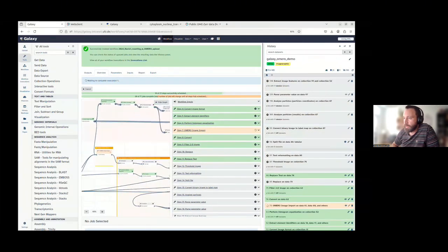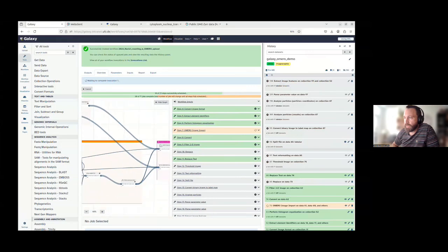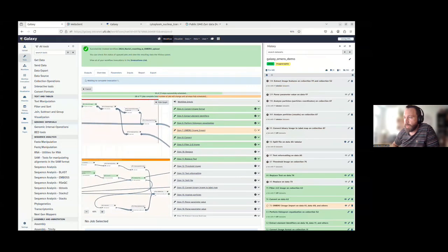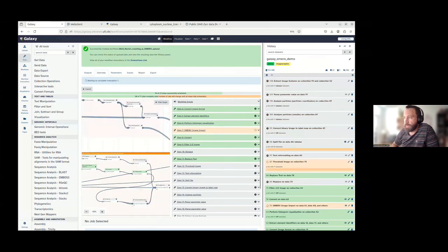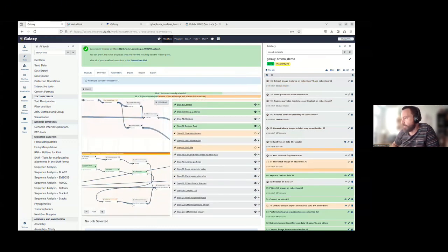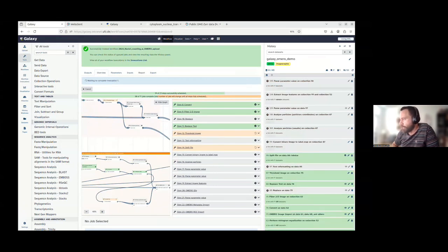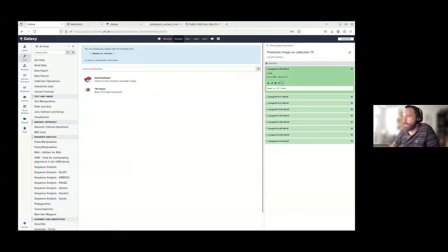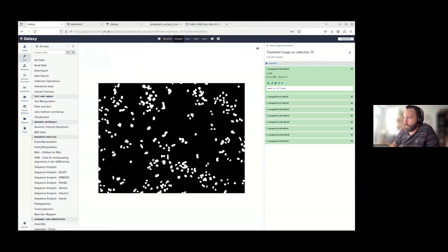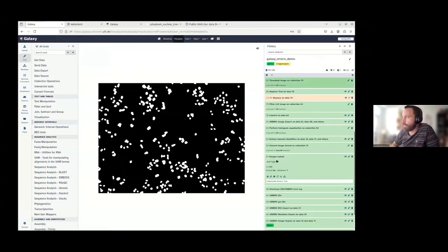As you can see, all the steps performed at the moment are in green, while some are still running. The Omero image import is running at the moment. It's performing some thresholding, splitting the file, some data wrangling. You can see they are running fine, it's going through. These are the results of the thresholding, for example. So this was performed within the workflow.